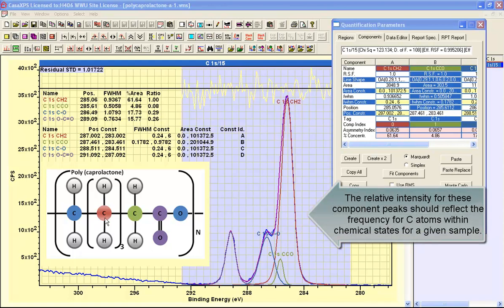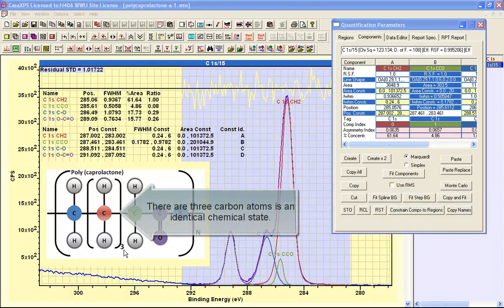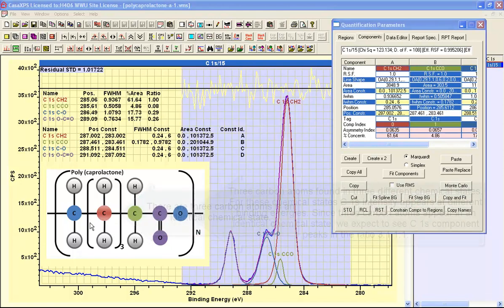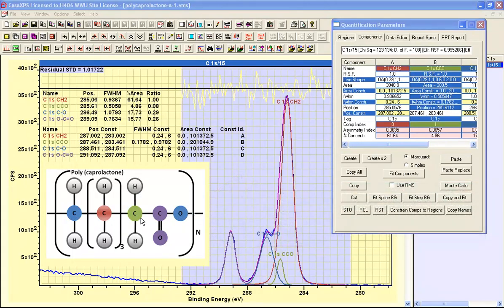We have one carbon that is found three times in the same chemical state, while we have three atoms, each of which are repeated only once in distinct chemical states.